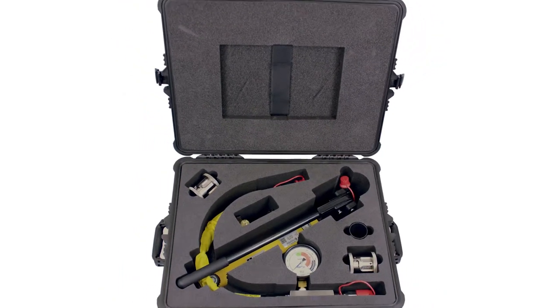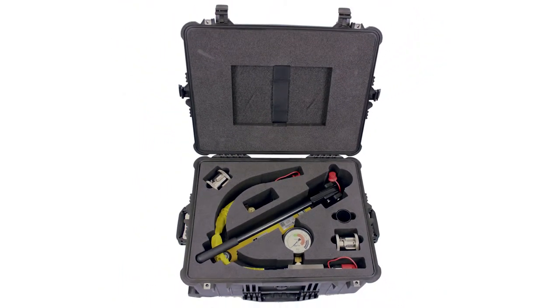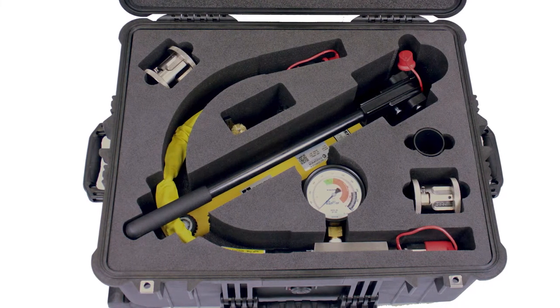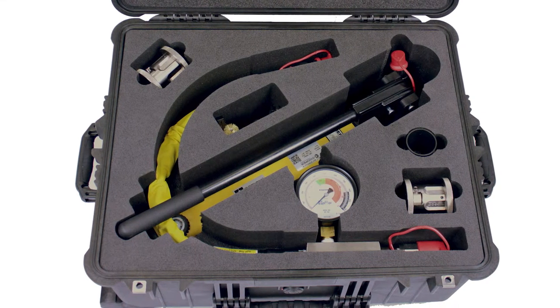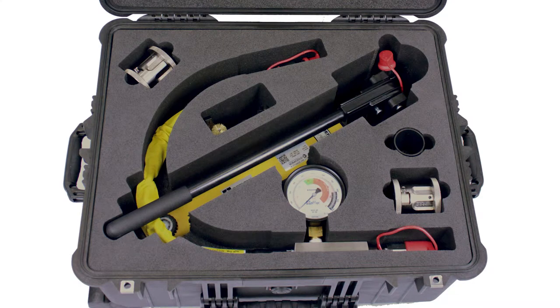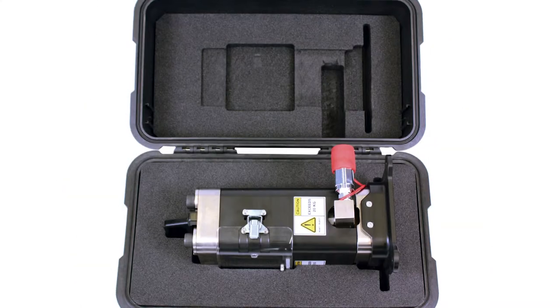The Reflex Press is delivered in two cases. The first case shown here is the hydraulic accessories case and contains the hydraulic pump, hydraulic hose with pressure gauge, as well as two sample dies, funnel, cleaning kit, and measuring spoons.